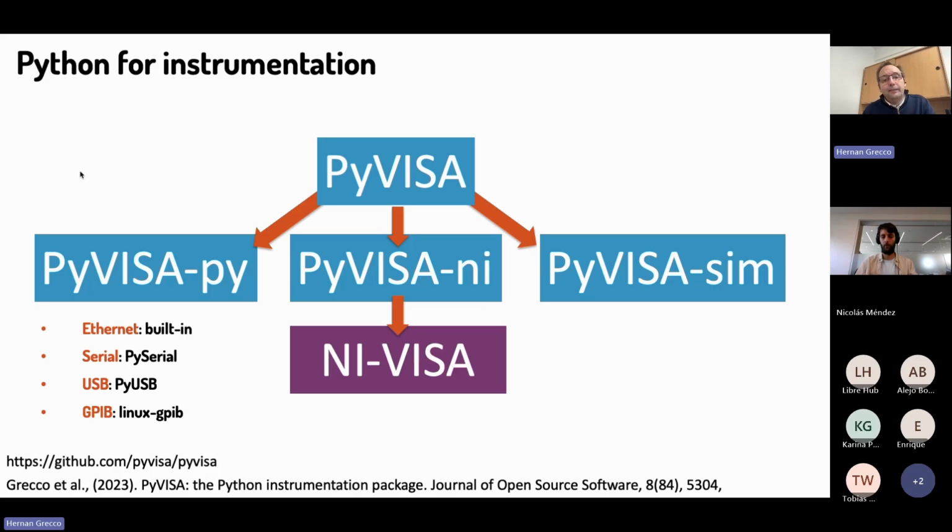PyVisa, as I mentioned before, is the default software to control instruments from Python. And the way it worked is that you already have a few libraries which are called Visa libraries from different vendors like National Instruments, Agilent, Keysight, and many more, right? And PyVisa is providing a front end to those vendors.